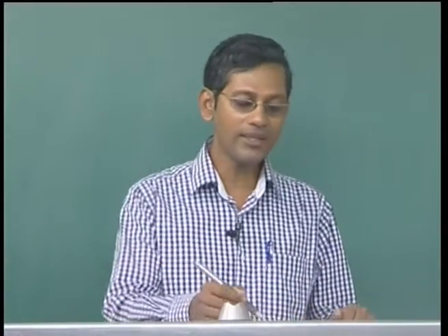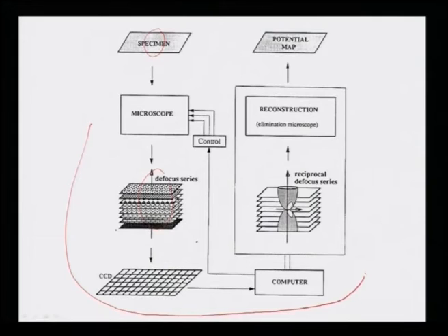So, that is actually the cycle in which we simulate the images and finally obtain the most comparable image. But you understand from this whole process, because there are a lot of input variables which can be changed, and also the complexity of the whole technique, that it is not an easy one to get information out of high-resolution images.